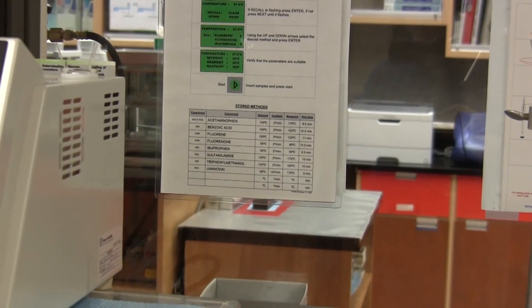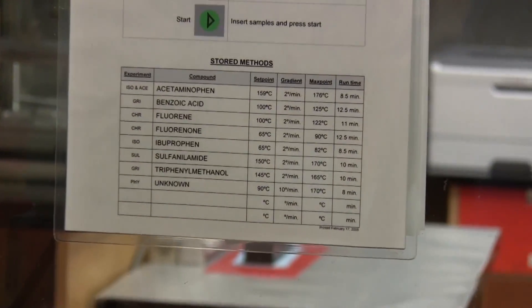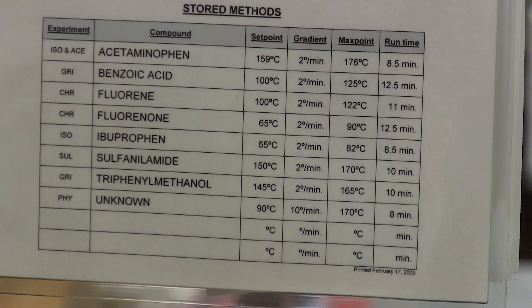A chart is displayed near the apparatus showing the heating profiles for the stored methods. Lauren has prepared and purified fluorenone, and we can see the heating profile for fluorenone. It shows that the machine will heat up rapidly to its set point of 65 degrees, after which the rate of heating is decreased to 2 degrees per minute until the temperature reaches 90 degrees. This is about 6 degrees above the expected melting point of 84 degrees.